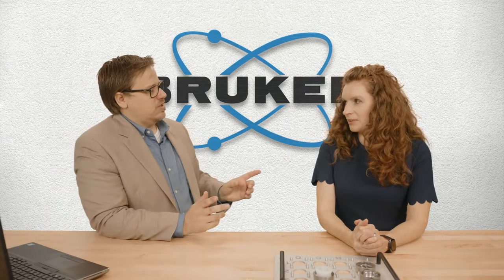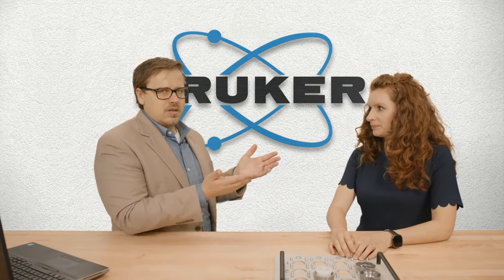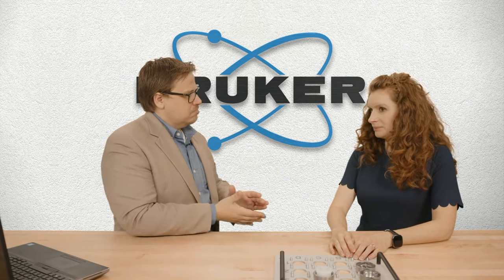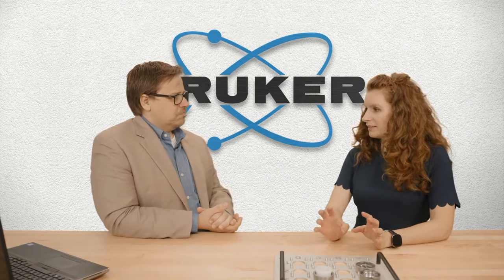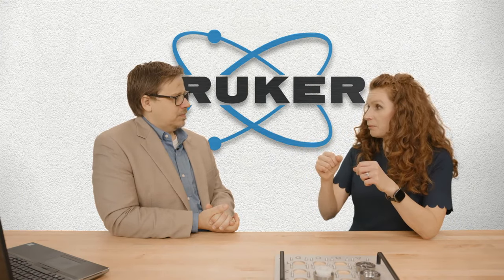So I think that there's two bits here, right? Let's make sure we're all clear on accuracy and precision. What's the difference between accuracy and precision? We always use this nice idea of a bullseye. The accuracy is how close to the bullseye you are, like if the average of where you hit is in the bullseye. And then precision is how far spread out you are. So precision is you get the same number time and time again. Accuracy is you get the right number. And those are two different things.